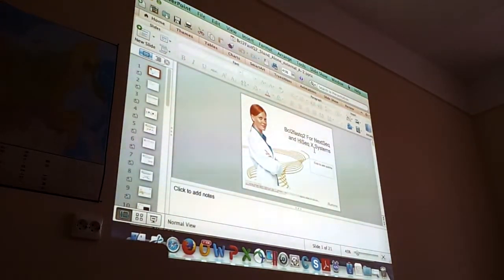In Russia, you are working on the HiSeq X, so it's our biggest system for population-wide whole genome sequencing. One system in US price costs 10 million, so it's expensive.